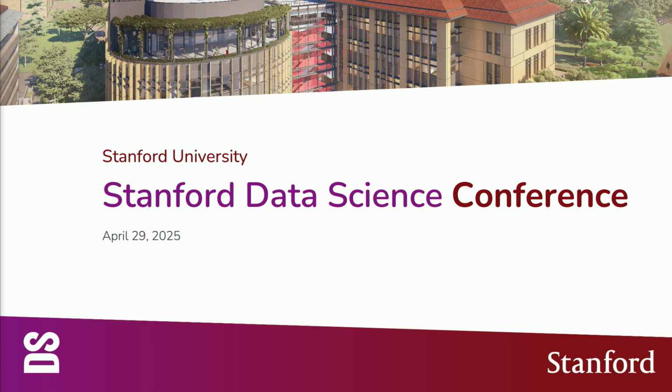Our next speaker is Dong-Hua Chen from Roger Kornberg's lab. Dong-Hua is an expert in structural biology and single particle cryo-EM, and he's going to be talking about how Marlowe has helped speed up some of the processing for the cryo-EM single particle analysis.